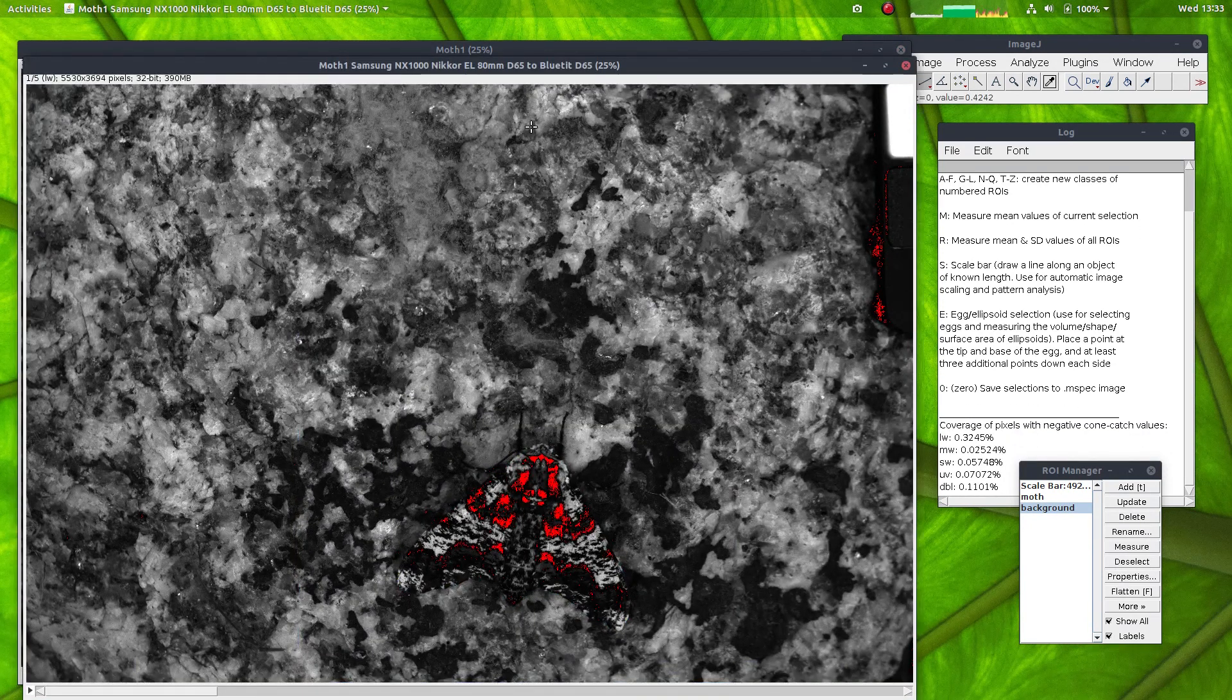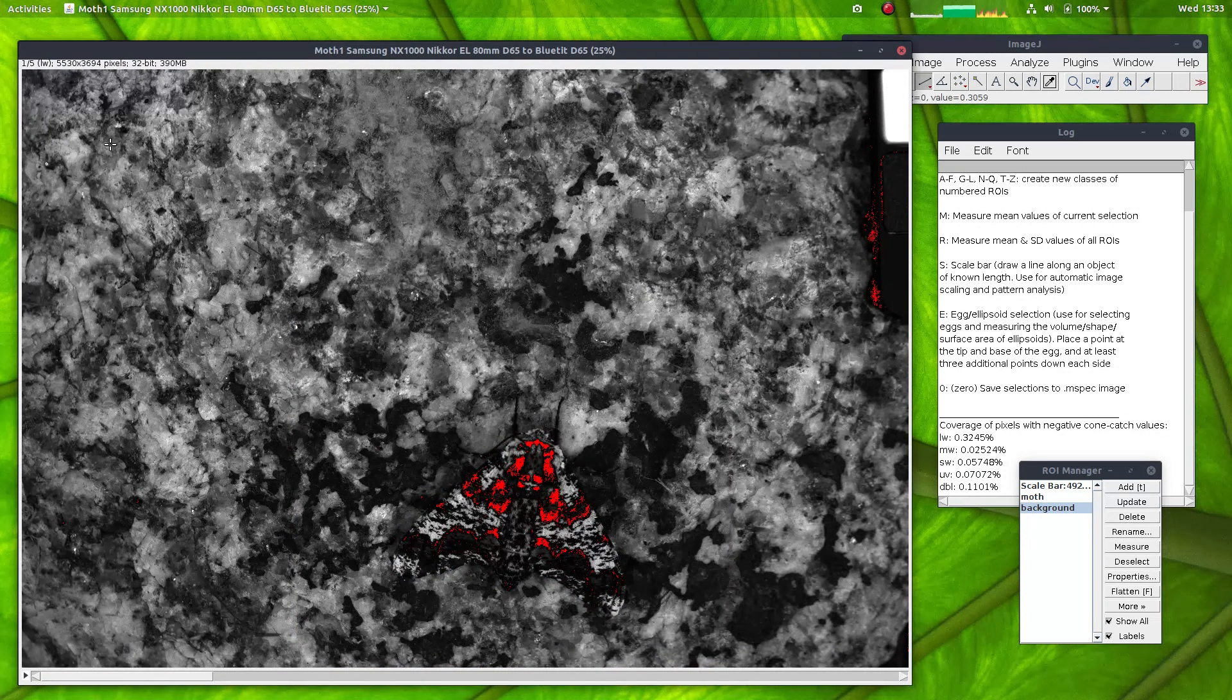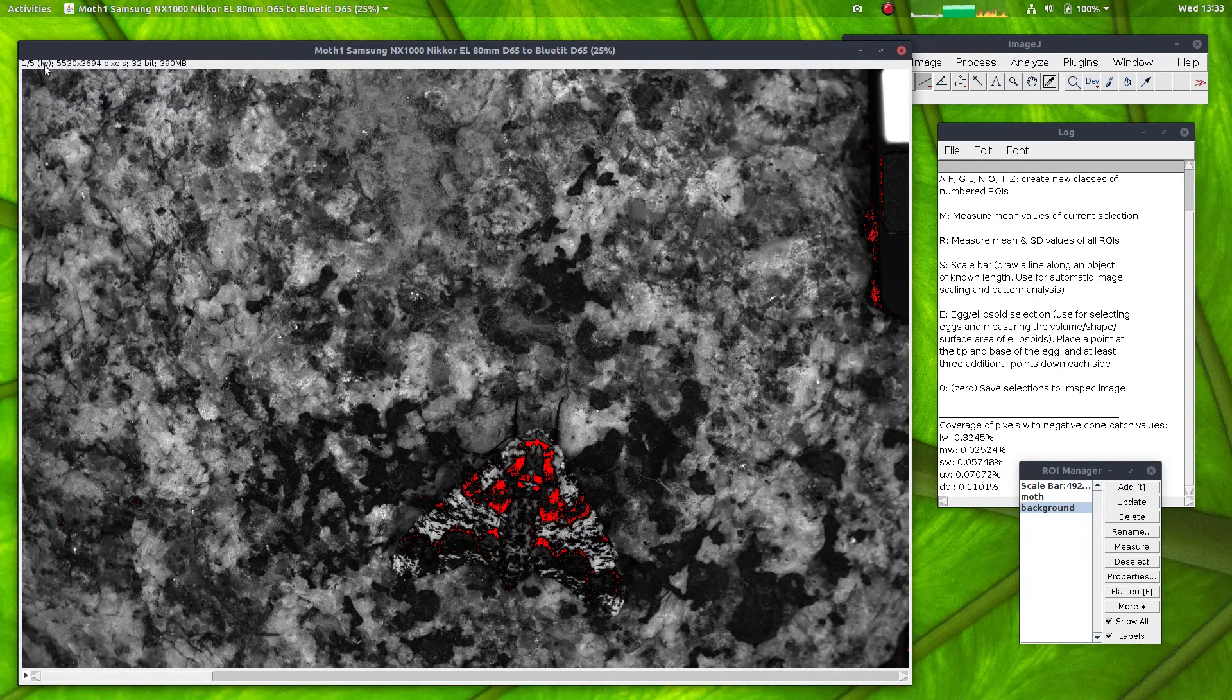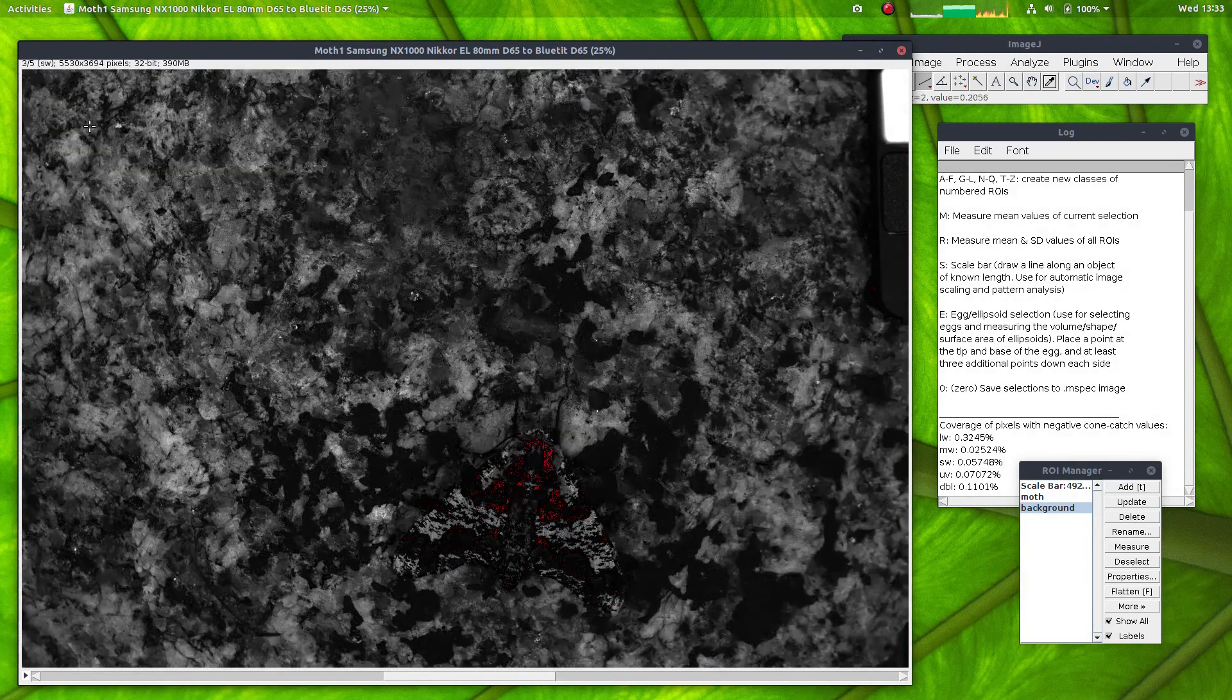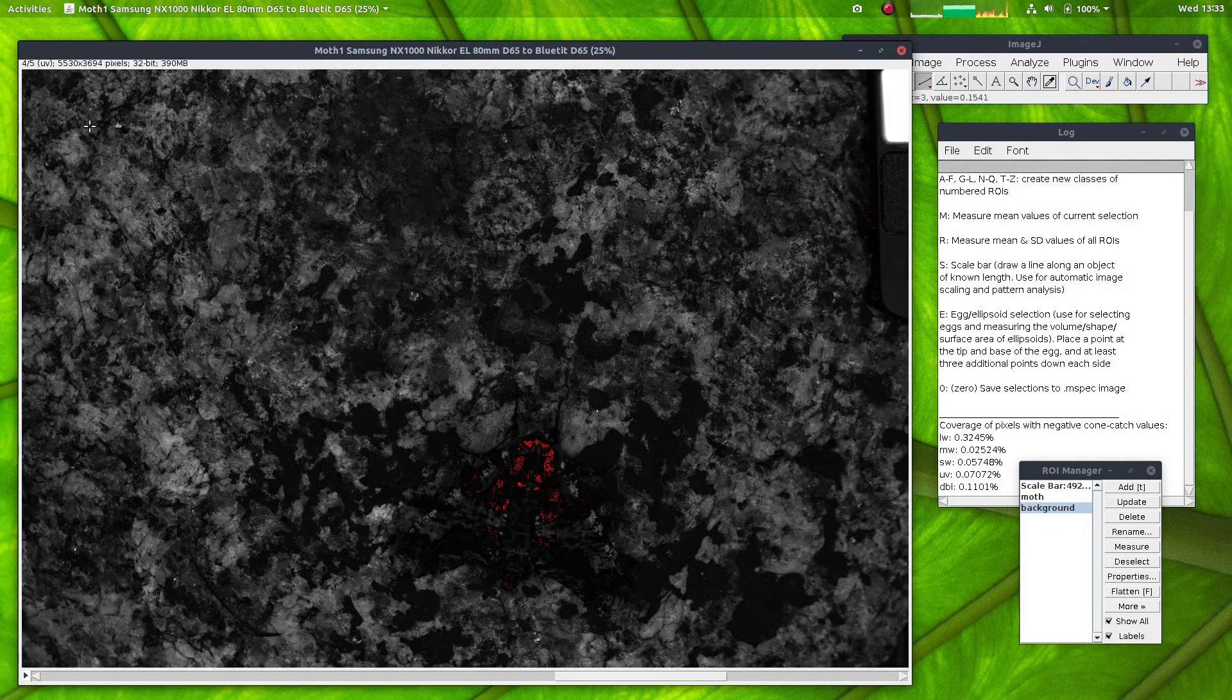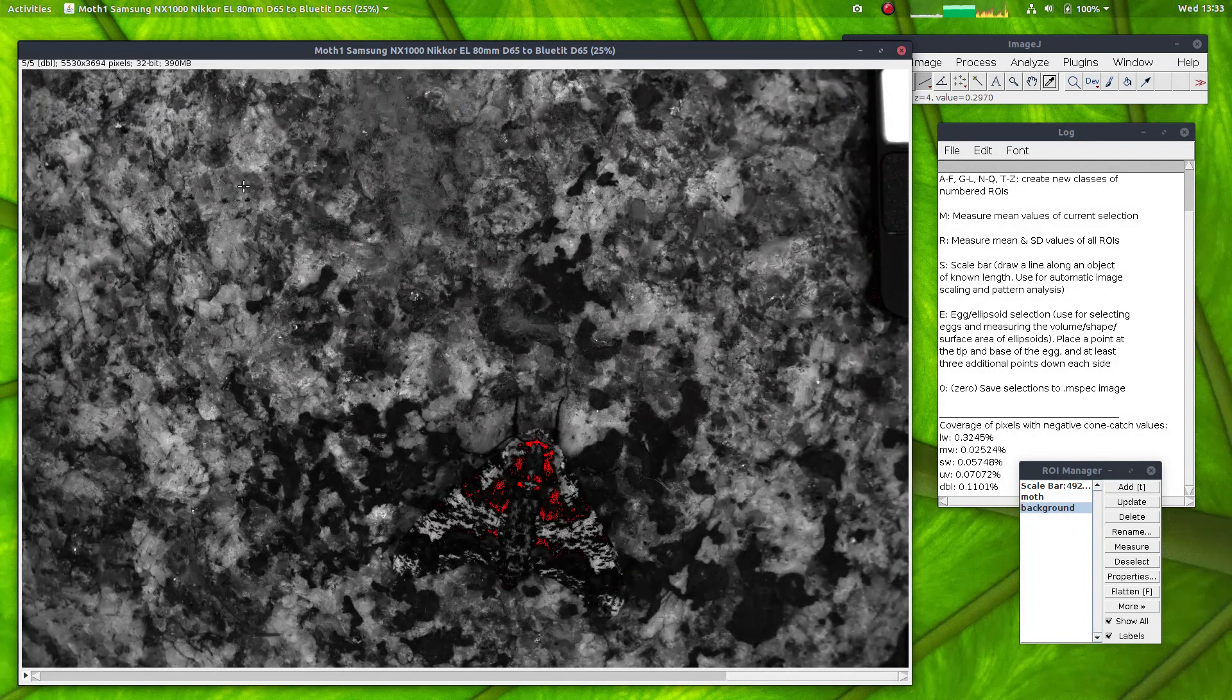Here the image has been converted to blue tit cone-catch quanta. Here we have the long wave channel, the medium wave, short wave, ultraviolet and double.